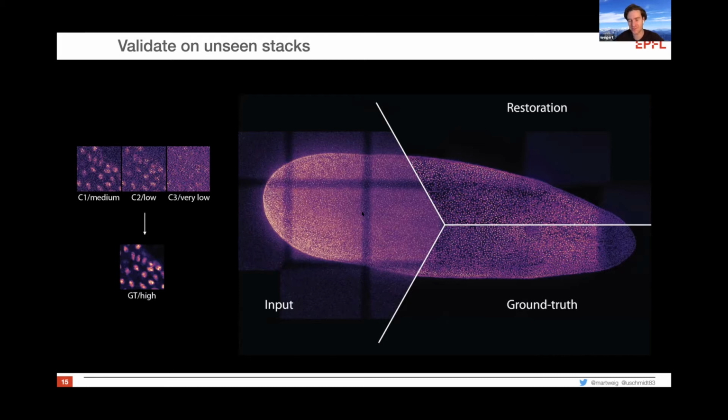So this is an interesting question. It's just strange for me, because I guess when you train on small patches of this image, it still managed to learn the vignetting somehow. Yes, because some of the patches actually had the boundary region, because we made sure that we always typically randomly sample from a given larger stack. And some of those patches had just the boundary with the vignetting. So this was included in the training data.